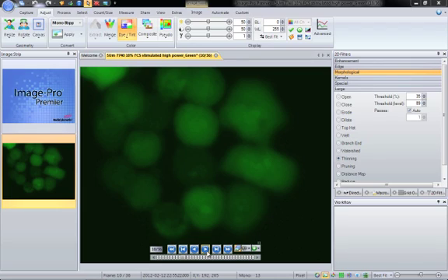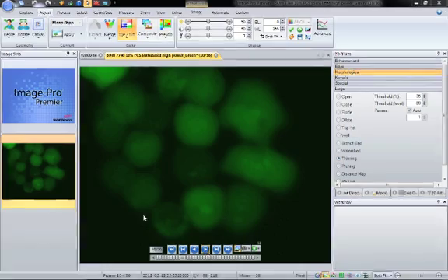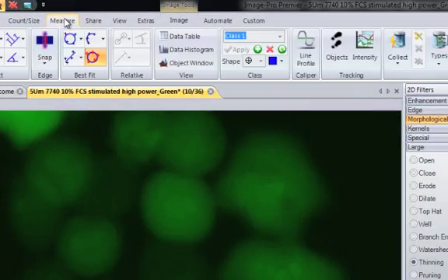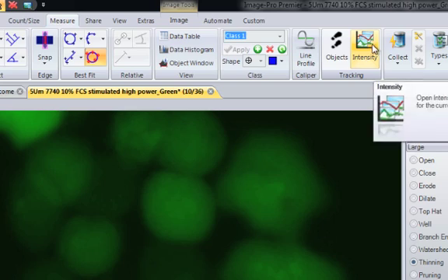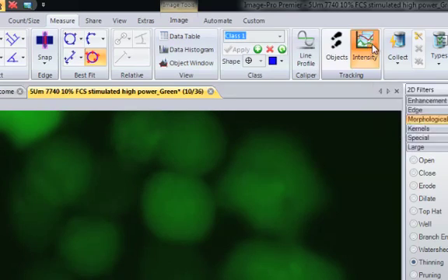So what we want to do is measure that. First we go to the measure ribbon here, and in the measure ribbon we have got the tracking tools on the right, click on intensity, and we will open the intensity track ribbon.